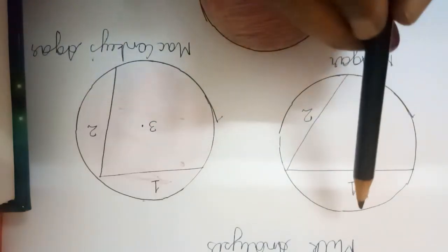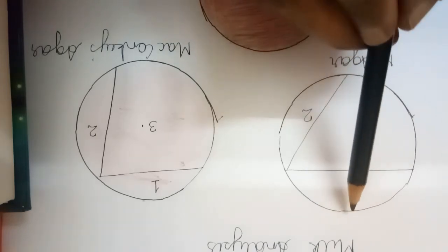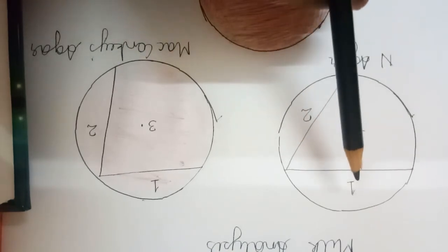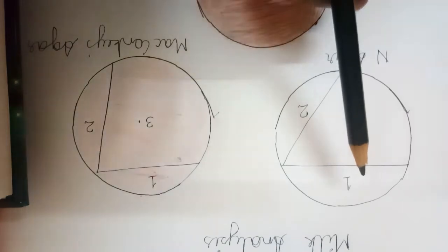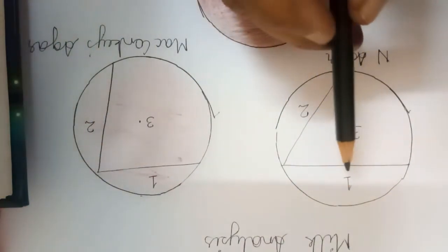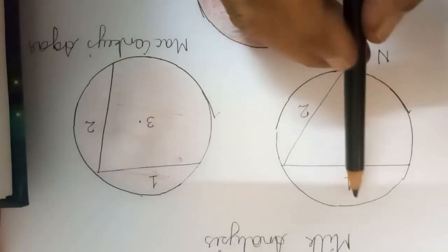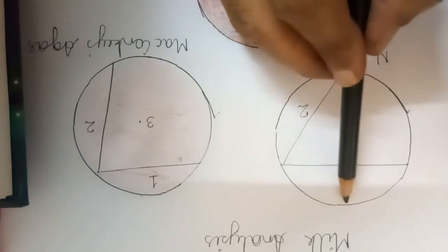Okay, so aseptically now we are starting the inoculation in the first sector. Okay, so it has to be done like this. Okay, so the first sector is to be inoculated now very nicely. Okay, so you can see that I have started inoculating.